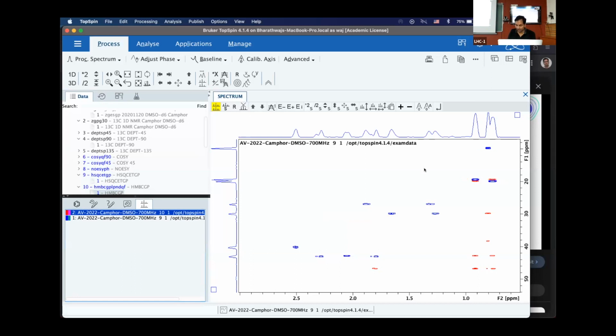So what you're able to see here, let's just take the methyl group. Are you guys able to see extra resonances from carbon going to a different proton? This indicates that the protons that you're trying to look at here are also close to these carbons in chemical space. So instead of jumping just one bond, this jumps more than one bond. So this way, what you have done, you know what's a CH, you know what's a CH2, you know what's a CH3. Now using this experiment, okay, I know this CH2 is talking to one CH and one other CH2. So slowly you will be able to stitch it across and say which carbon and which proton belongs to which entity in camphor. Go back and think about this. It'll make a little more sense.